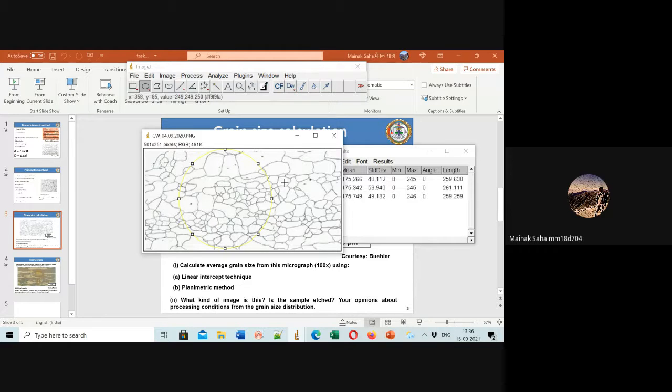If you are not able to do the classwork, try to put a scale on the computer screen, and then you can try to do it. That is the manual method. I used to do it like that once. It is not scientific, but okay for understanding. I just want to see your approach, how you are able to do it. That's it.